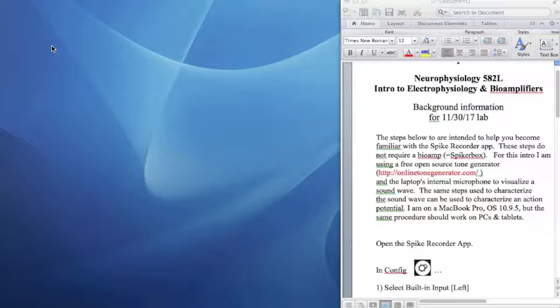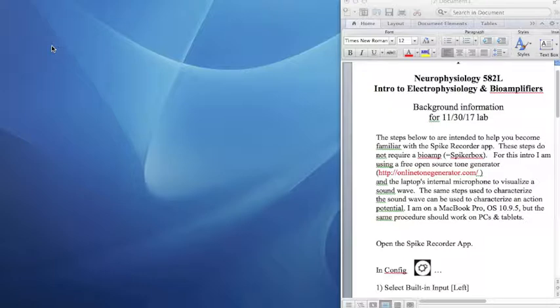Hello! The goal of these screencasts will be to provide background information for the BIO582 lab held last November 30th, 2017. This first video will summarize the key features of the Spike Recorder application, focusing on the steps required to measure the elapsed time between two events.